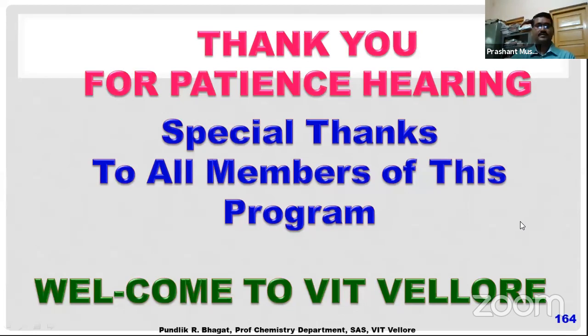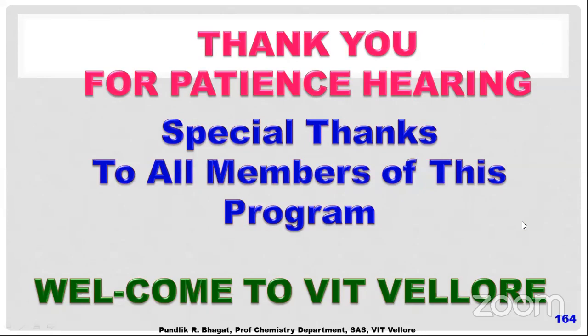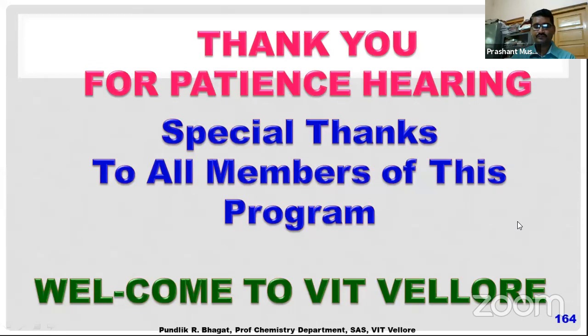So I think it depends on the solvent which we are using. Of course, for example, toluene we are using, or acetonitrile, which is not absorbing any UV or visible light. If we change the solvent, because there are polar and non-polar solvents.